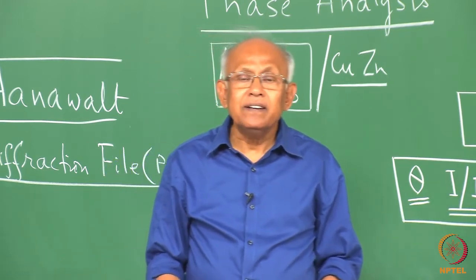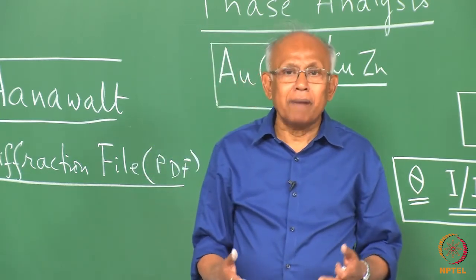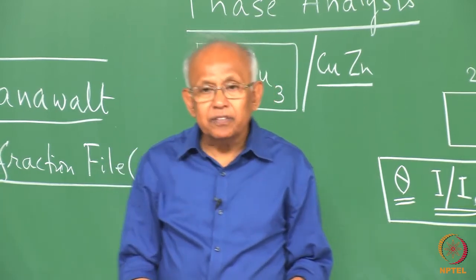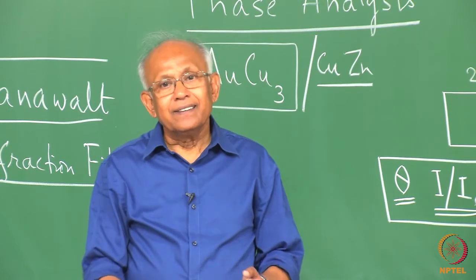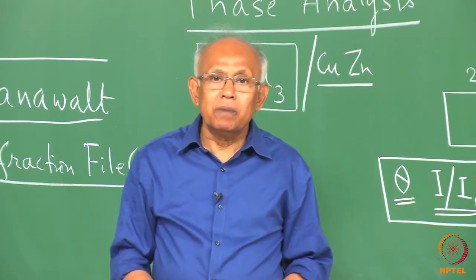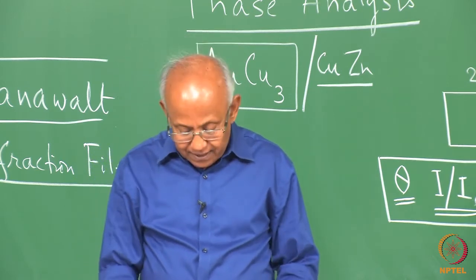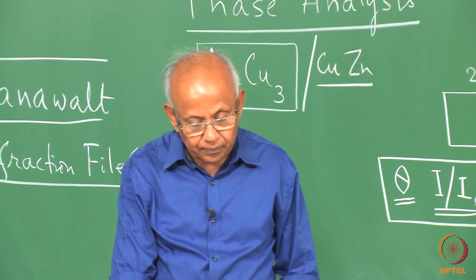And if we find a complete match of the diffraction pattern of the unknown material with that of the data in one of these cards, then the identity of the unknown material becomes known. So, this is basically the method of qualitative phase analysis.